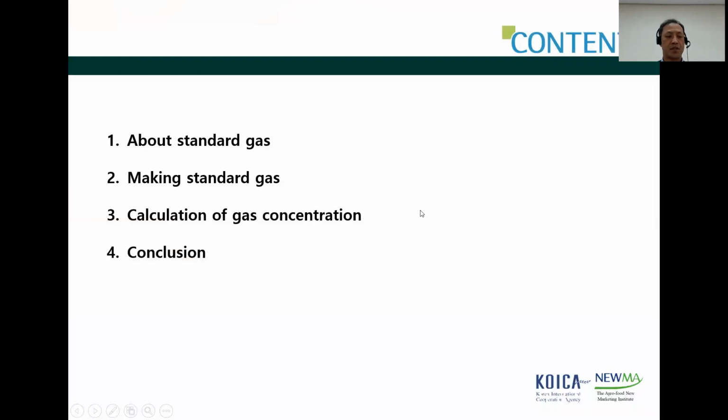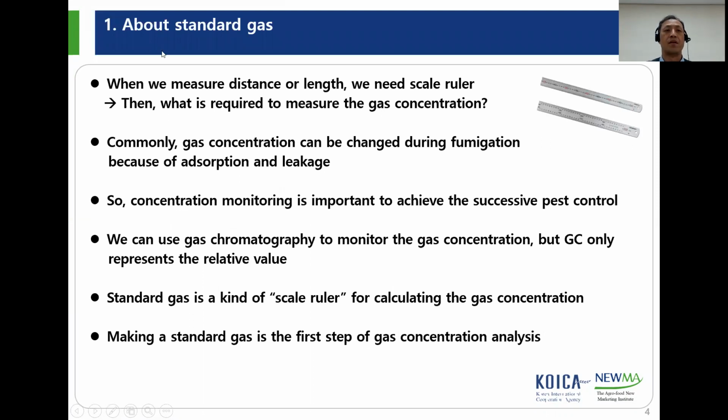I made a presentation in the following order: 1, about standard gas; 2, making standard gas; 3, calculation of gas concentration; 4, conclusion. This is about standard gas.